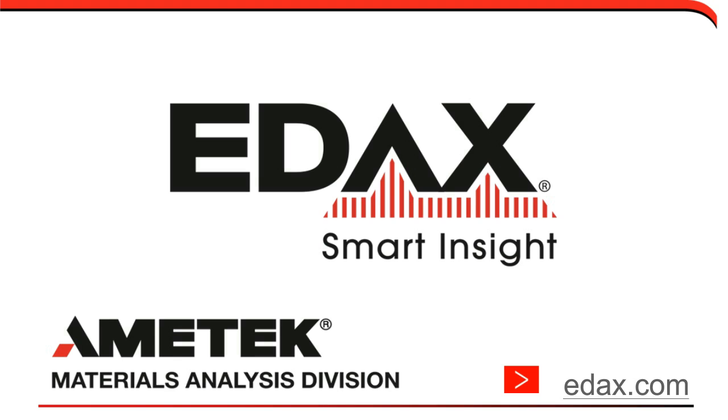Another question came in. Do I need to change any EBSD acquisition settings to optimize the images? Not really. You just have to use your current settings and enable the pattern storage to look at the PRIAS post-acquisition images. For the live images, usually it's optimized that you go to the highest binning possible and limit your number of pixels. It depends on the speed of your camera and the total number of pixels, so you really need to have the camera operating very, very quickly in the live mode to do that.